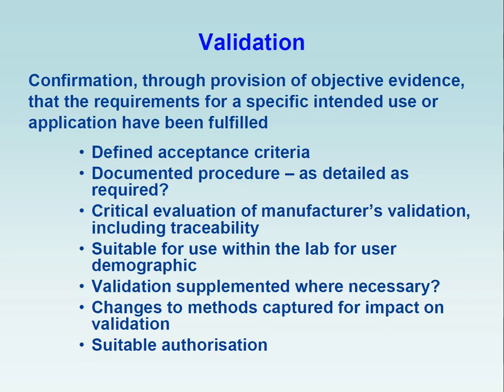Changes to any of your methodology will have an impact on your validation, and you need to retest. So David talked earlier about Euroflow. That is probably the single test that is most validated within flow cytometry. However, if you use your CD19 on a different fluorochrome, you need to revalidate everything. That completely throws the whole assay out. If you use a different lysing reagent, the whole assay is no longer validated.